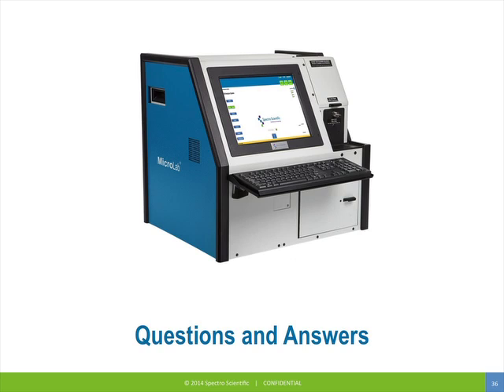Maybe we'll go back to some application questions. I see quite a few rolling in right now. So, Jim, why should you measure TBN in oil? The TBN is crucial, and like I mentioned in one of the first questions we had, extending oil drain intervals, it's one of the key parameters we use. The TBN in the oil lets us know once it hits a certain point that the oil is no longer useful for the properties and the protection it's providing to the engine itself. So monitoring TBN is definitely a key parameter to follow.